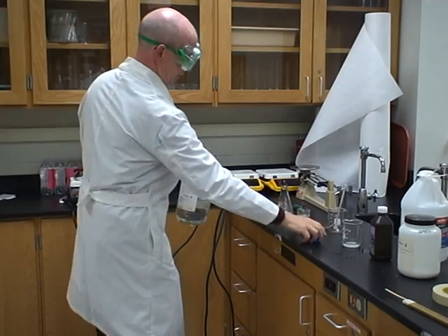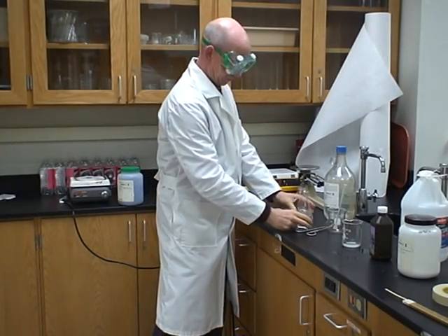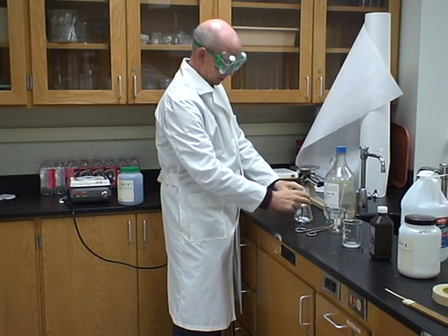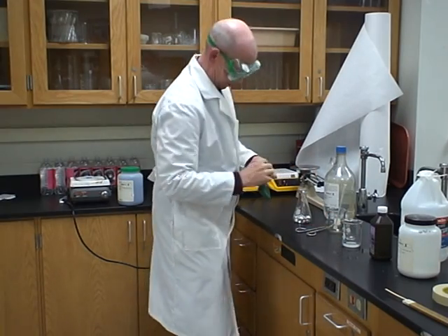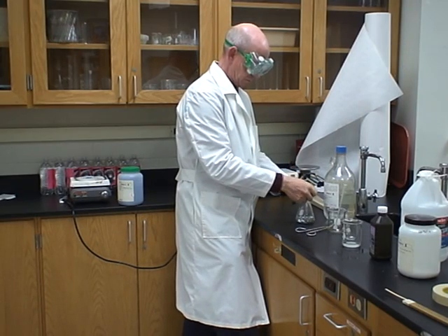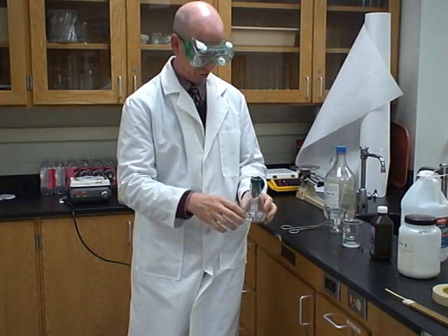You probably can see the smoke there. This is dangerous stuff. I diluted the acid because we don't need it full strength. Now I'm going to put it in this flask here. And inside that flask was some aluminum foil. I'm going to put a balloon on top of the flask, and then we're going to take this to the fume hood.